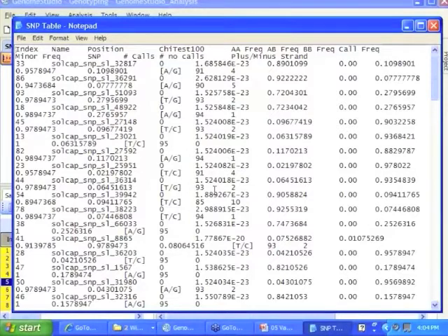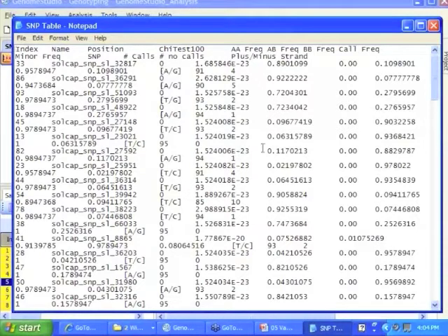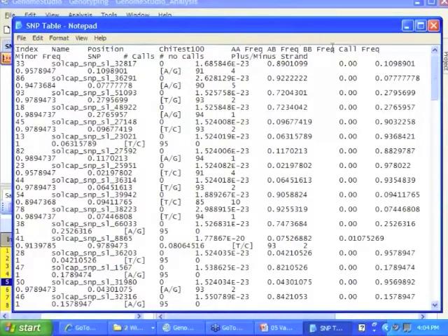So to get more into your database that you may have in your company, whatever program you want, this is basically a flat text file that comes out with that data.